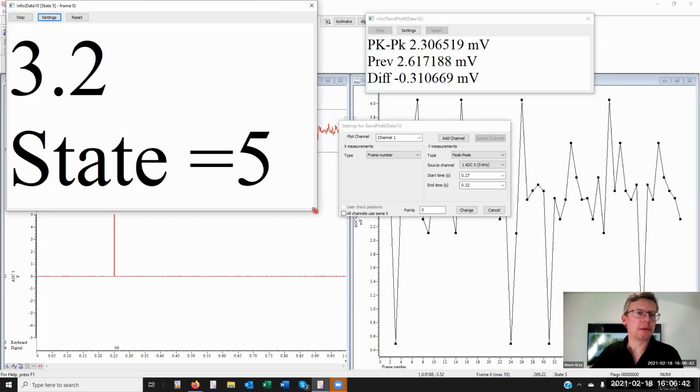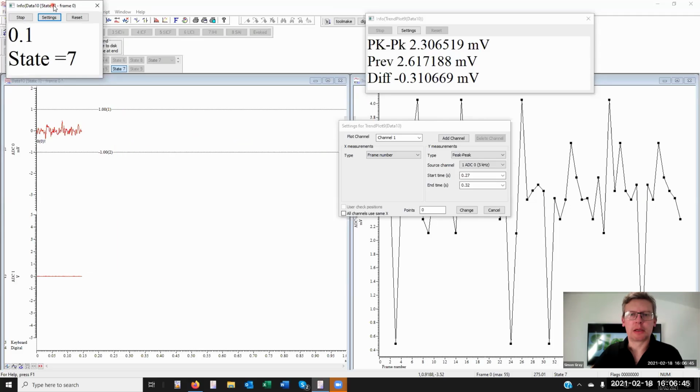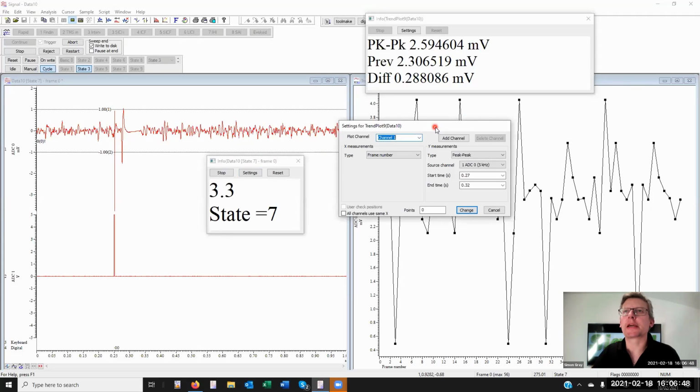Okay. Just pop that away, and I'll just get back to the XY view.